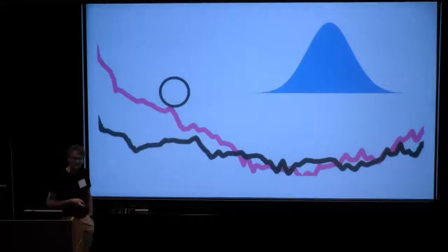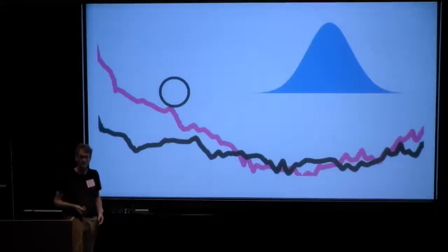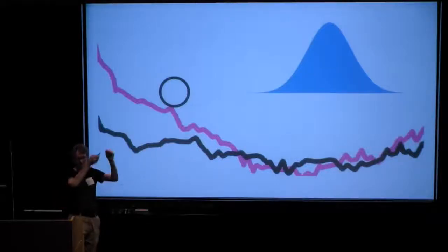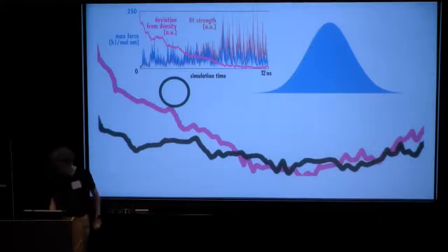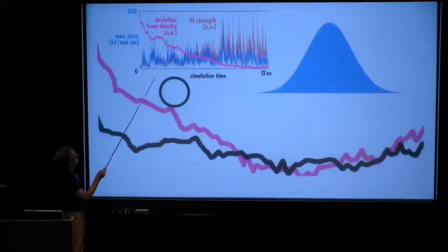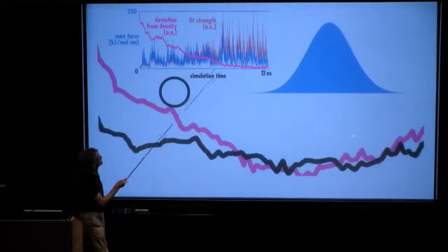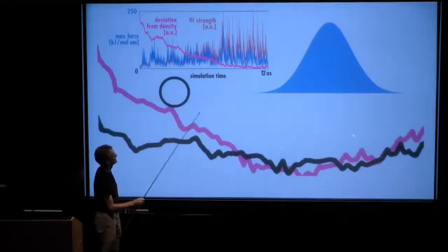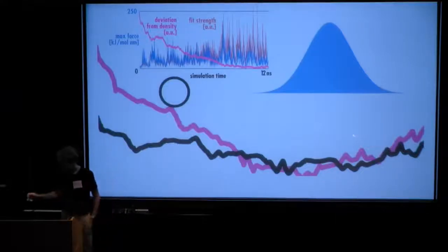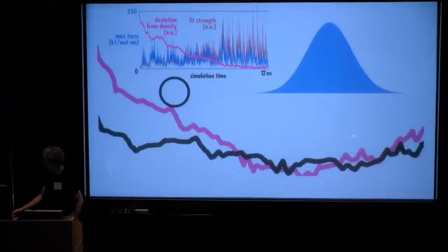So what we do here, we even tune this so that if things stop going downhill, then we start to bump up the force factors. If we stop the refinement, then we apply more and more refinement, and as the derivative then increases, we take down the strength again. So this works remarkably well, actually. Once we start getting close to the end game here, occasionally we go up in force, but since we don't really improve anymore, we take it down again. So this is still a little bit based on trial and error.